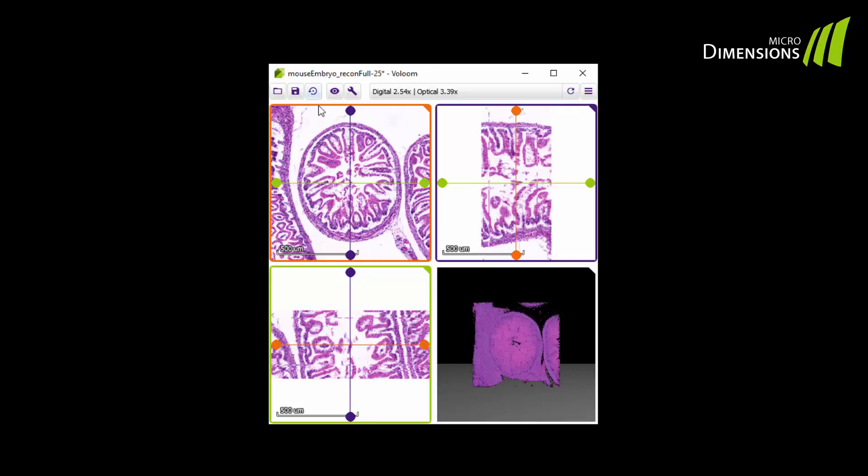In the second view, in the upper right corner, you can see the stack of your sections as if they had been cut along the purple axis you see here.